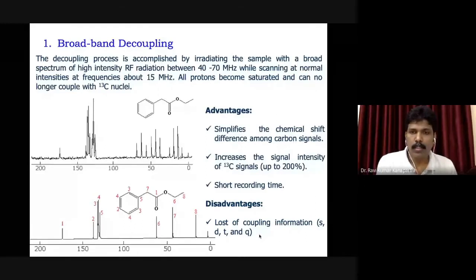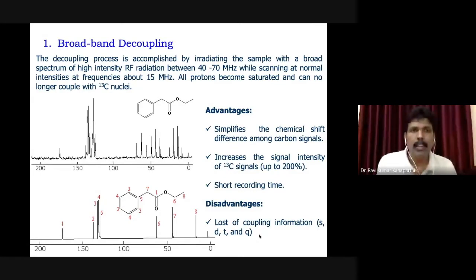So, good morning, students. We will continue the previous lecture, and if I'm right, this is where we stopped the previous lecture, and we were discussing how to handle the spin splitting pattern in carbon 13 NMR spectroscopy, especially. The spin coupling is mainly seen from the 13 carbon which is connected with a proton, and these coupling constants are really high, and as a result we find it very difficult to interpret the spectrum because they occupy much larger space in the spectrum.